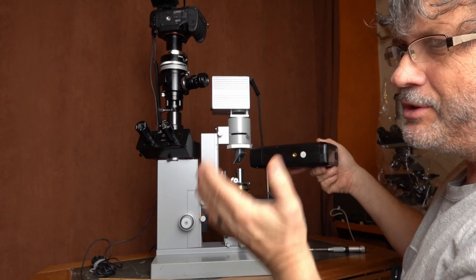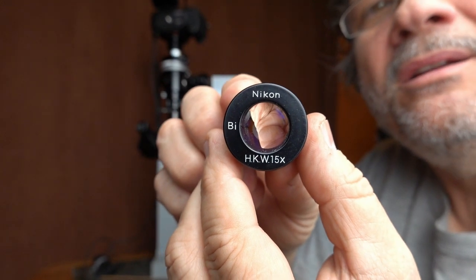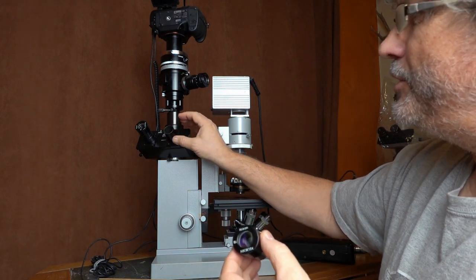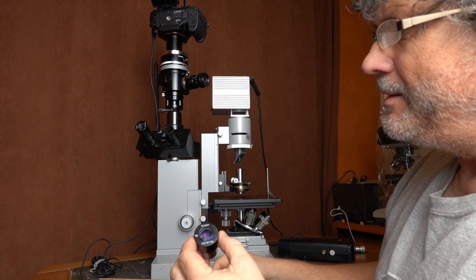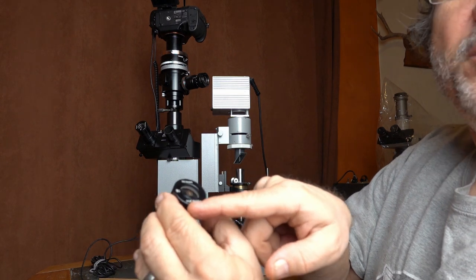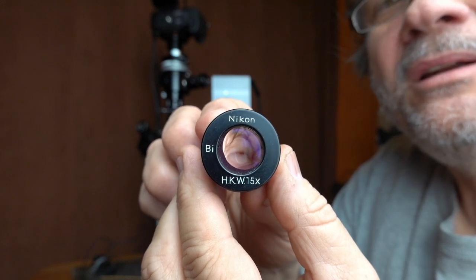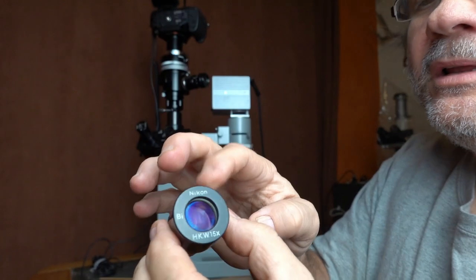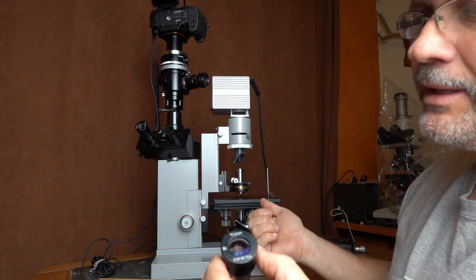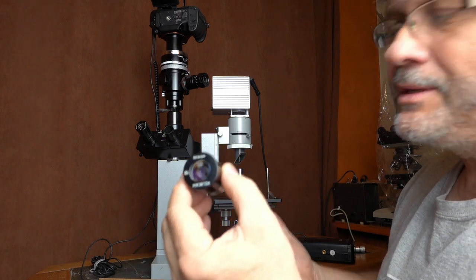I use Nikon 15-power HKW eyepieces. I've chosen 15-power because that gives me the same field of view in the eyepieces as on the film or sensor plane. H means high eye point so you can use them with glasses; K is compensated; W is wide field. Compensated here means the eyepiece has some compensation for the 160mm matched objectives, but I find mixing them with Leitz objectives works just fine.